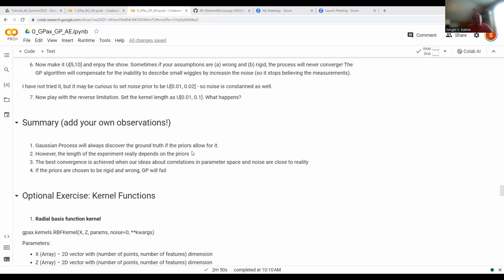In other words, we choose them based on the prior knowledge and quantification of the system. If the behavior of the instrument on some particular day turns out to be completely off because somebody forgot whatever, one of the aberration correctors burned or something like this, then we are out of luck. Then we simply start to pay attention to the instrument behaving totally different.